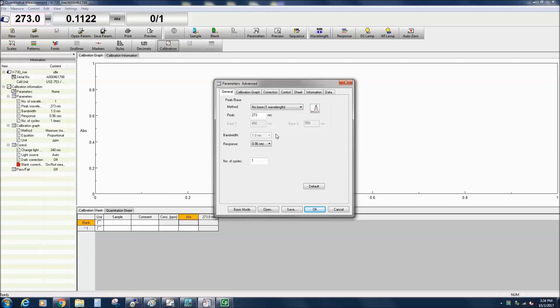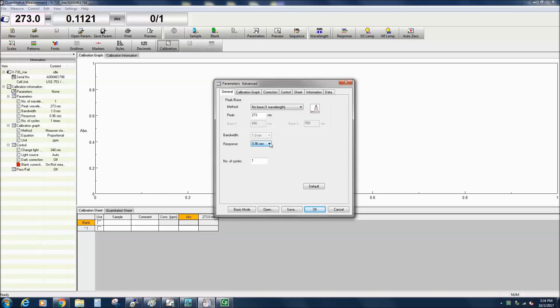The response is the time spent accumulating photometric or absorbance values. The response time can be increased to obtain better signal-to-noise ratios for samples with small absorbances. If Basic mode has been selected, the optimum response is automatically determined from the specified bandwidth.